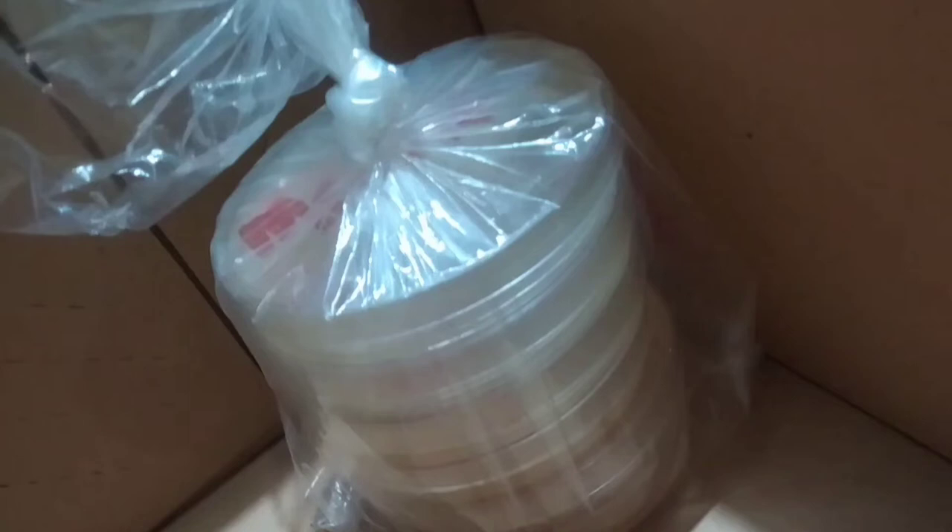In this step we are storing our samples and placing them in a cardboard box for 48 hours. During these hours our bacteria are multiplying and forming colonies.